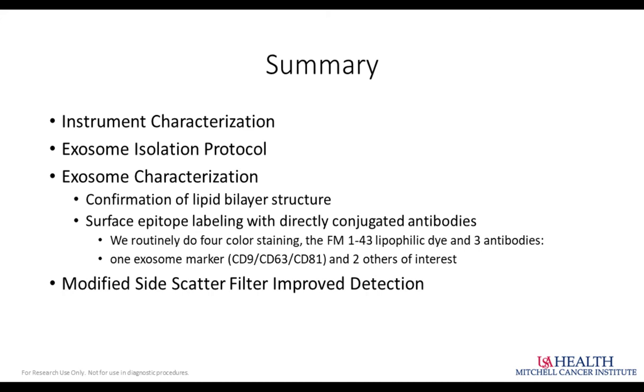What you're looking for is a signal-to-noise ratio where, if you have antibodies at too high of a concentration, the negative cells will kind of creep up and be brighter. Optimally, the process of titration really is to maximize the space between the negative and the positive population. So when you do your titration of different concentrations, that's what you look for. And then at a certain point, of course, you're going to start to drop off your signal, so you know that's gone too far dilute.